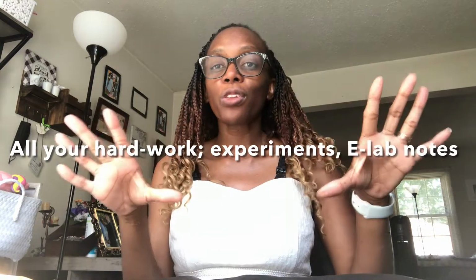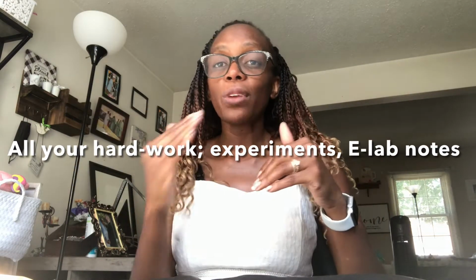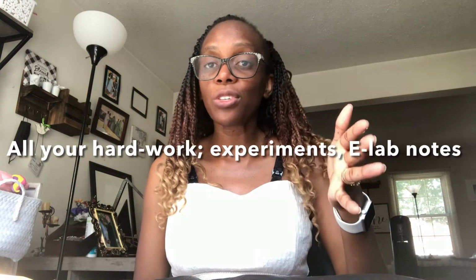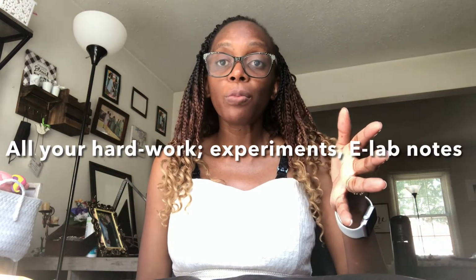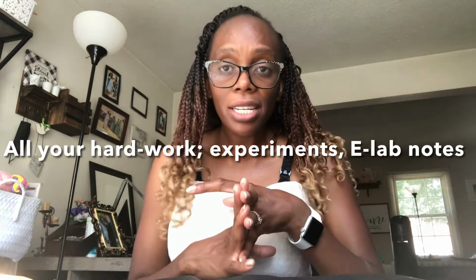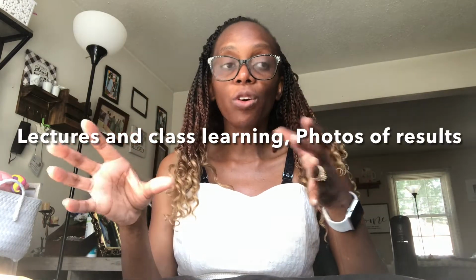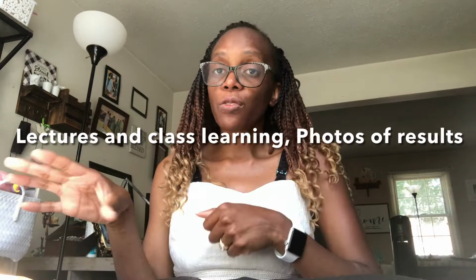All the work you've done filling out your eLab notebook every week, you always update your eLab notebooks, talking about the title of the experiment, why you did it, how you did it, the methods, and what results you got. And every week you include photos of your results in the photo uploads.